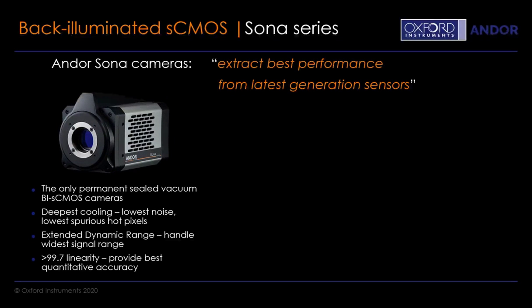And since in many studies, like the one that's been shown, quantitative accuracy is one of the fundamentals of any imaging camera whenever we're trying to analyze that data, beyond just the simple taking of the images, it's very important to have a quantitative camera, and that has been one of the aims in these cameras as well, to make them as accurate as possible.